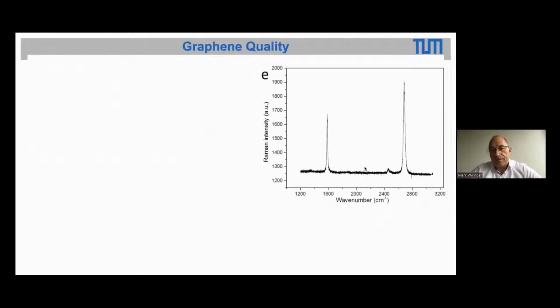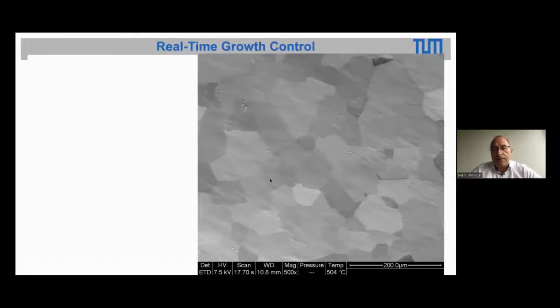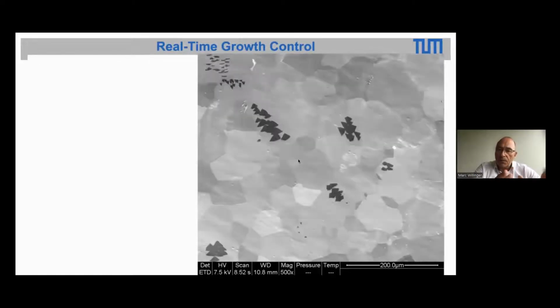And yes, as I mentioned before, we did Raman, and we characterized it with TEM, and the graphene that we have been growing in that instrument is actually quite nice. Now there's an advantage of doing things in situ. So you have actually the full control of all experimental parameters. So we control the heating temperature of our substrate. We control the gas phase, so we can observe growth.